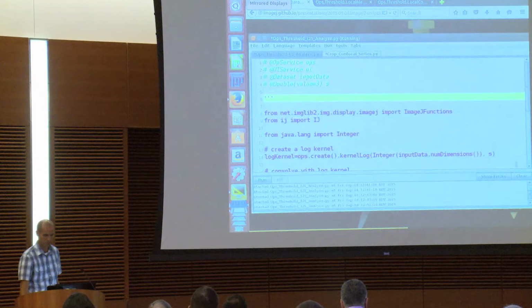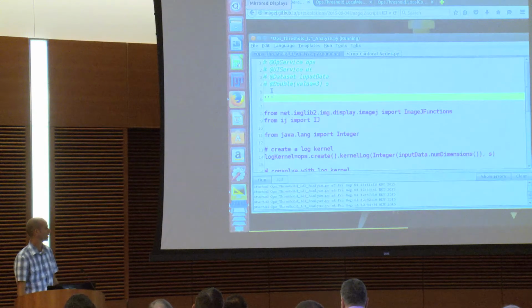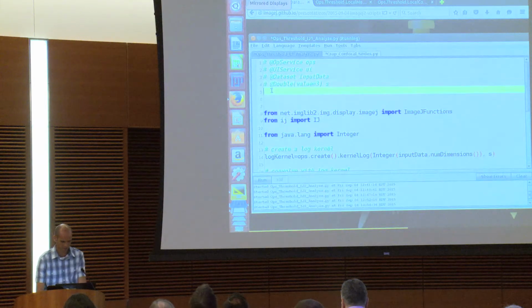So if you just want to test your parameter harvesting, or just the first part of your script, you can comment out the rest of it really quickly and fiddle around with it so you don't get all the outputs and everything generated. So if I want to add a Boolean here.